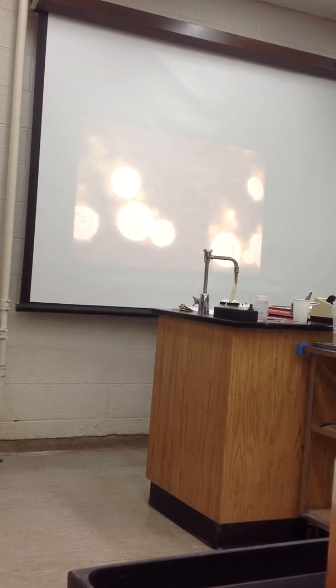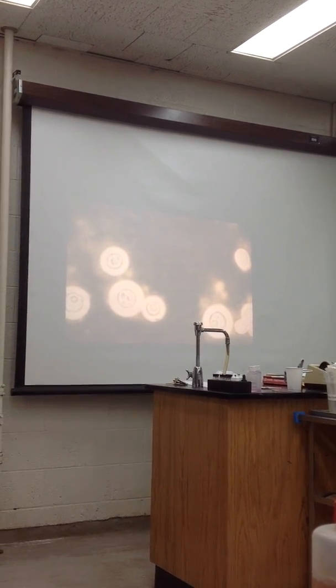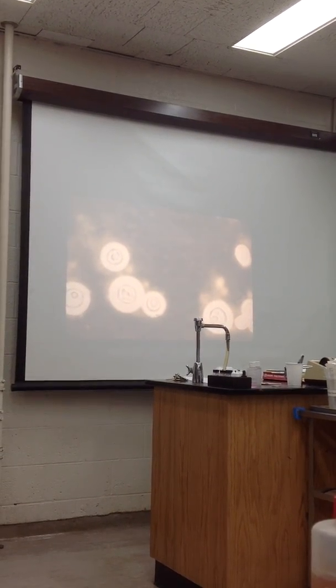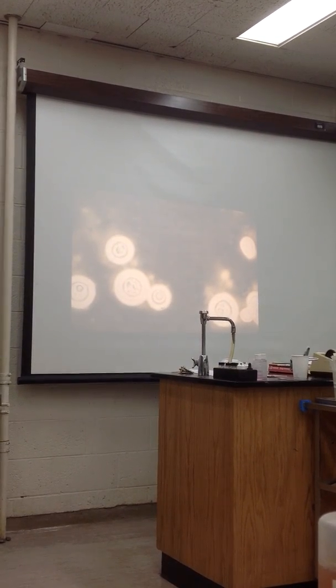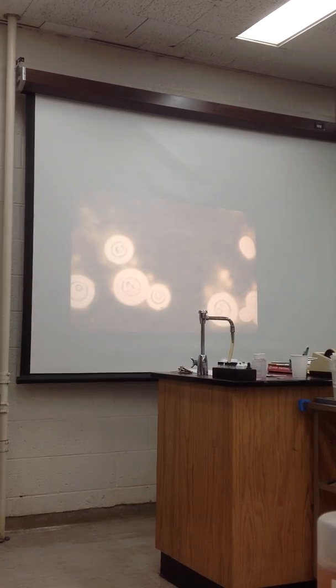Pretty much the same thing. Some is Martinez. And you identify that organism. No, I don't know. So if you have it there, why don't you know what it is? Because I recorded you and I took a picture at the same time, but I haven't had time to listen to the recording and write down the name of the organism. That's the reason I say you draw it and you put a name next to it.